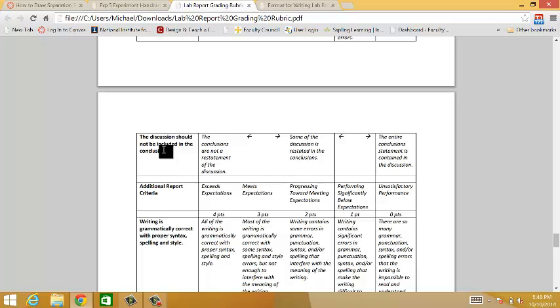So, don't discuss why your yield was low. Just say my yield was low. The discussion should be where you showed product loss. Or the discussion should be where your yield is over 100%. Or the discussion is where you have talked about the fact that there was a dichloromethane peak in the GC as an impurity. So, in this case, you shouldn't include those parts of the discussion.